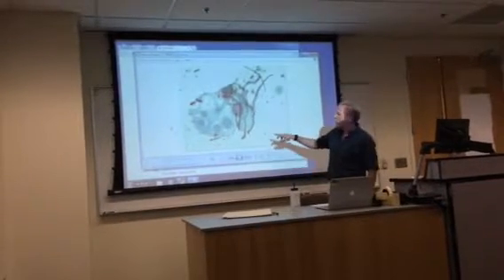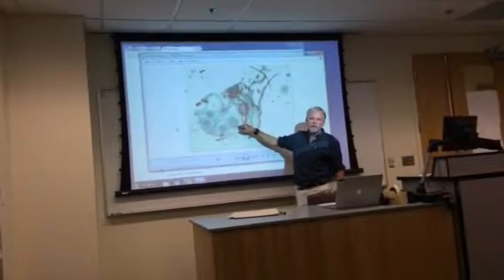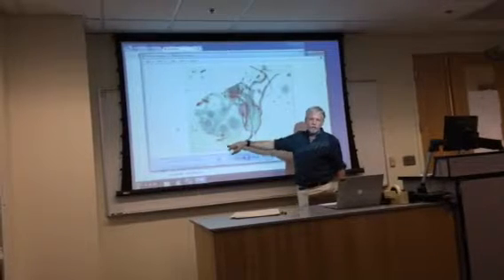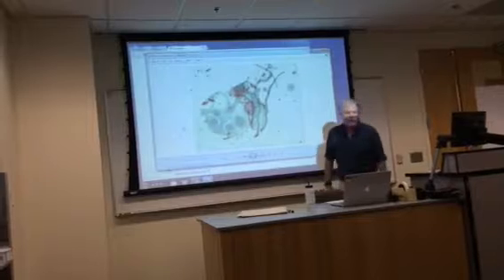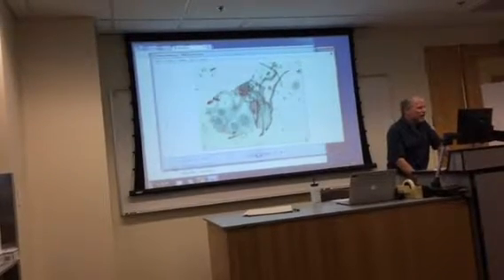They provide capillarity, they keep these guys moist, facilitate the sperm motility by swimming through a continuous film of water. These guys will rupture, sperm will be released. They'll swim over to another branch.